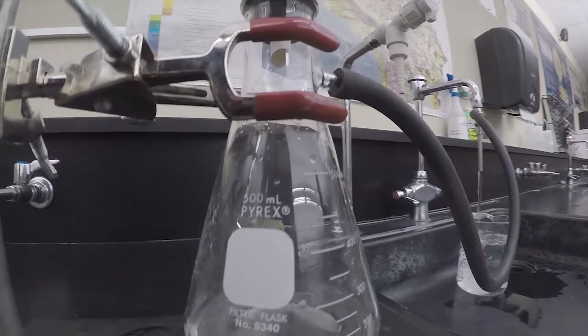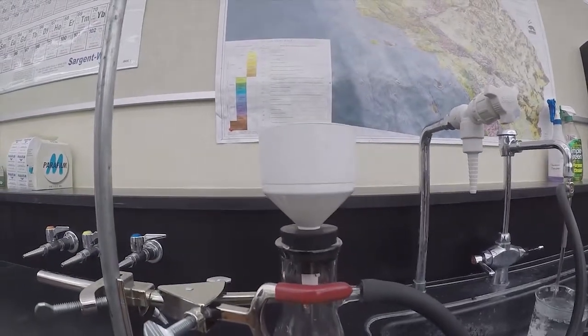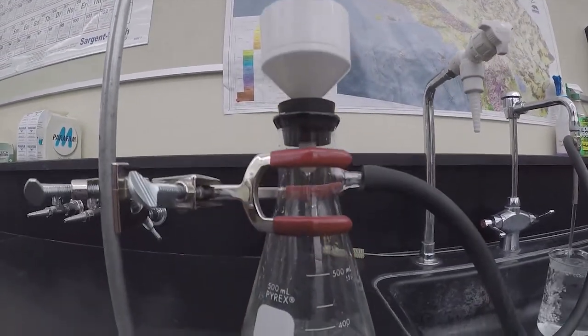Don't quench it with cold water, as this may cause the glass to shatter if there are micro cracks. Always keep flammables like methyl alcohol away from heating apparatuses such as Bunsen burners or hot plates. This can cause fires, flashback, or ignition of invisible vapors. When appropriate, use clamps and a ring stand with equipment such as vacuum filter flasks to secure them in place.